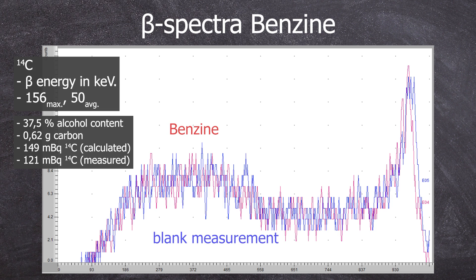This is the spectrum of benzene along with the background measurement, and as we can see, we can't see anything. No carbon-14 in benzene because this is washing benzene which was produced from petroleum. Isn't that cool?